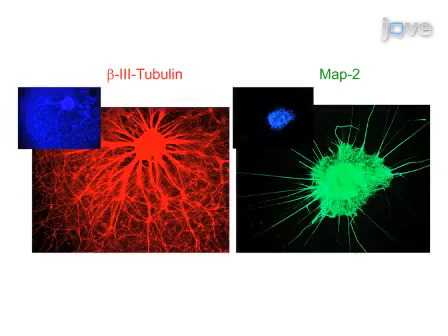Ultimately, immunofluorescence and deconvolution or confocal microscopy can be used to show the effect of retinoic acid treatment in morphology and marker expression of treated human embryonic stem cells.